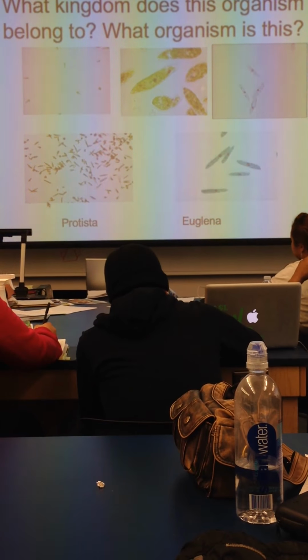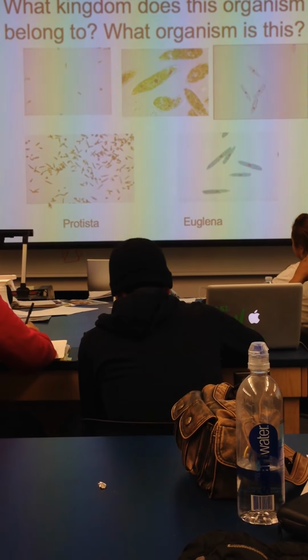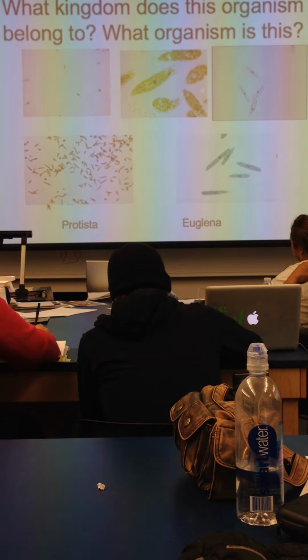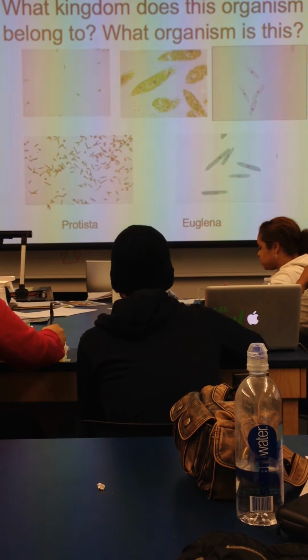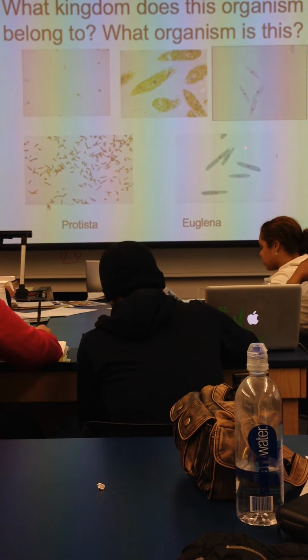Okay, remember Euglena is a plant-like or photosynthetic protist, but pretty much the only thing you can identify is the nucleus, especially in the preserved guys. So they have an oval-like shape for the most part.